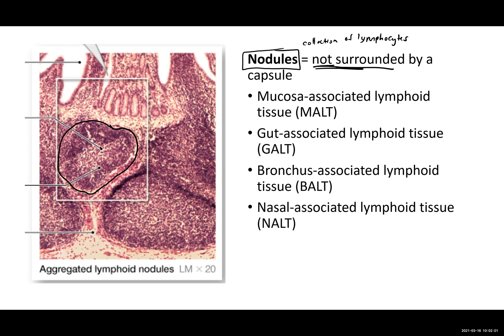What we can see with this line here in the center is what is called the germinal center. This is where you have lots of dividing lymphocytes — we should think dividing lymphocytes. These are our T cells: remember our cytotoxic T cells and our B cells, which ultimately become plasma cells and produce our antibodies or immunoglobulins.